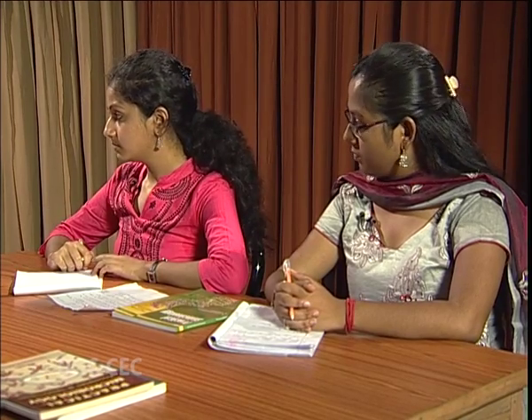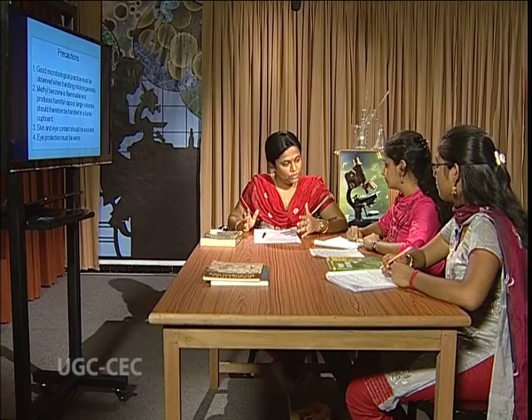In today's lecture, I think you have understood the basic principle of the lactose operon and the various gene regulations that make bacteria so suitable to accommodate in the environment. And we have finally highlighted the tidbits of executing the ONPG assay, that first of all, whenever you execute an experiment, you should do a qualitative assay. There, if you get a positive response, then you will go for a quantitative assay to compare the level of expression of beta-galactosidase between different strains of bacteria. So that's all for today.